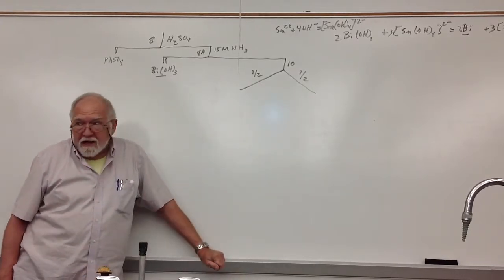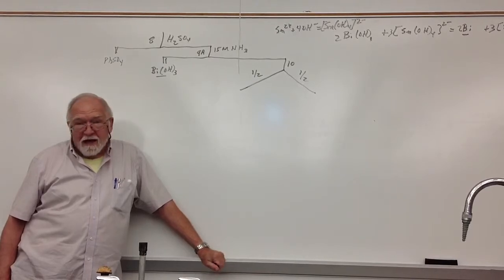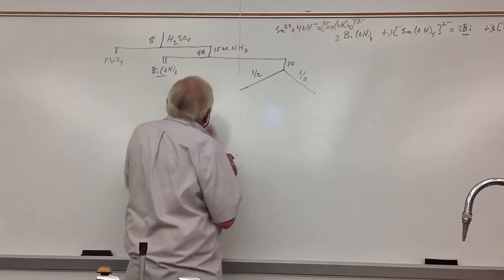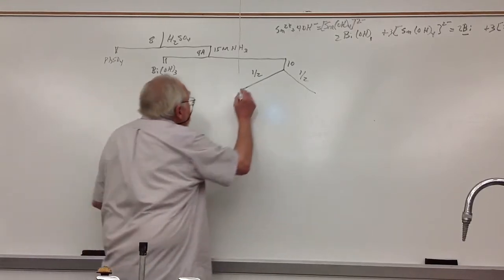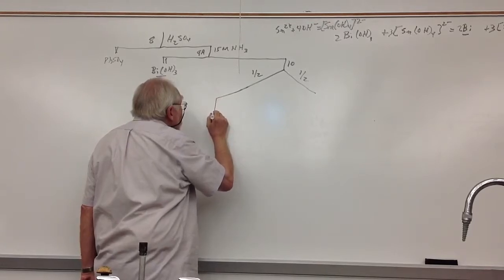One part is for 10A, which is the copper detection, and the other part is for 10B. And that's the decantate from 9, right? So just where it says 5 drops, divide in half.